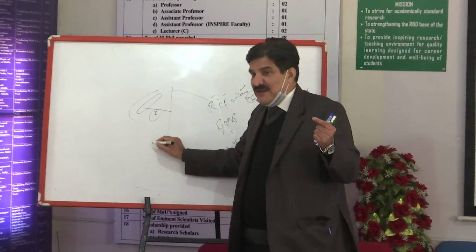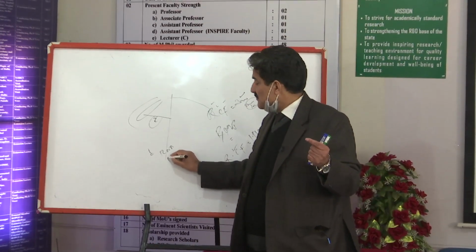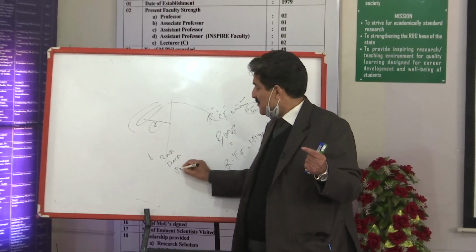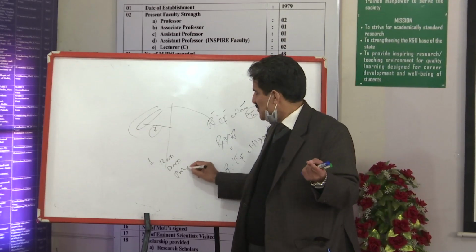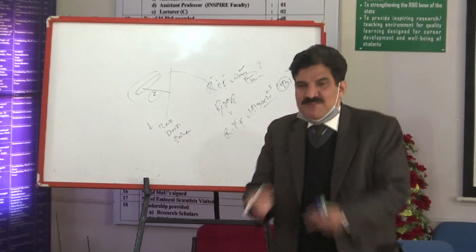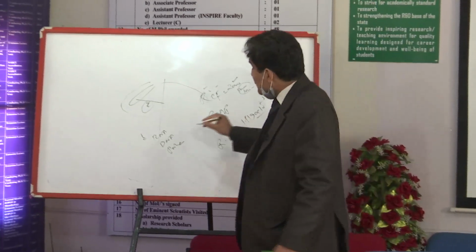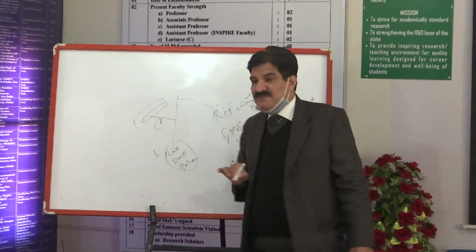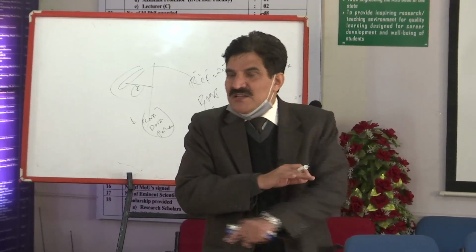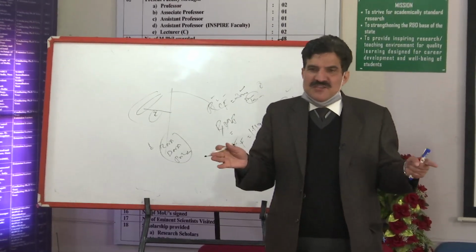Now from plants, I am saying, the solution now contains RNA also, and DNA. It contains histones and other proteins. So it contains three components maximally, because other components have been taken out by precipitation, because of high centrifugal values, S values. But these three things are now at maximum. From these three and other things, you have to get which thing out? DNA. Your choice is only DNA, not RNA. So from this step, I will utilize different procedures, different processes for isolation. It is your choice.